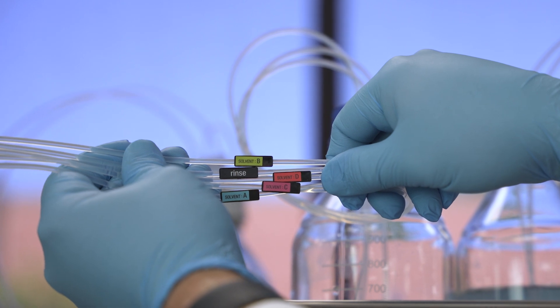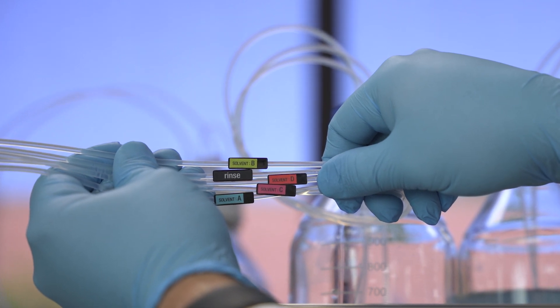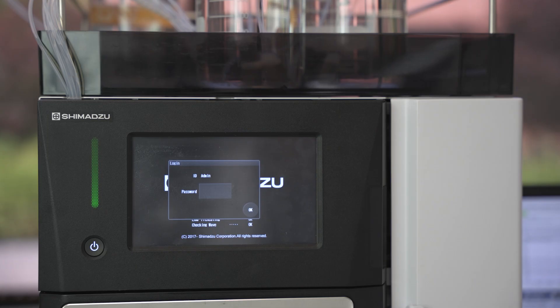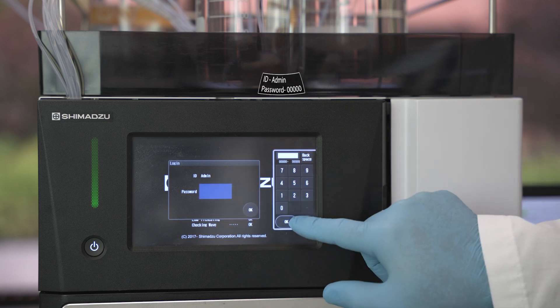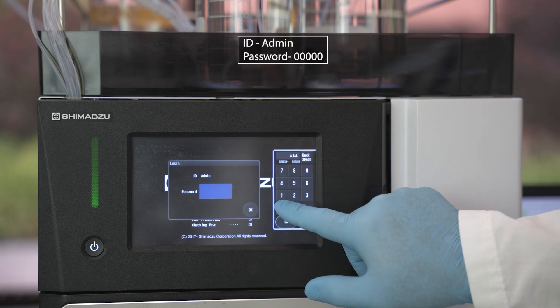The rinse line labeled as rinse goes into the bottle with the auto sampler rinse solution. If you see a logon requirement, the ID will be admin and the password is five zeros.